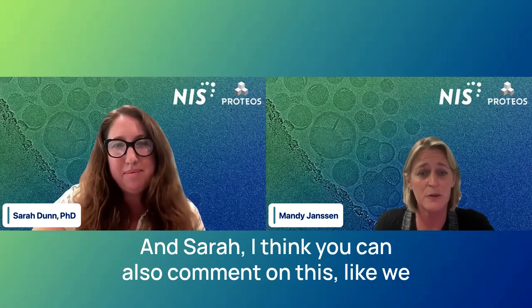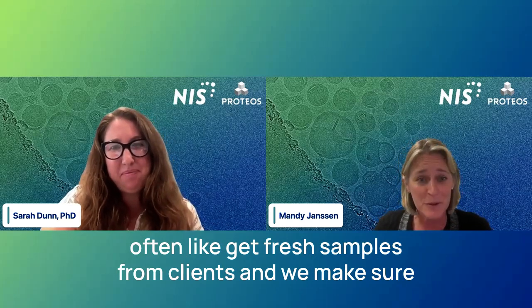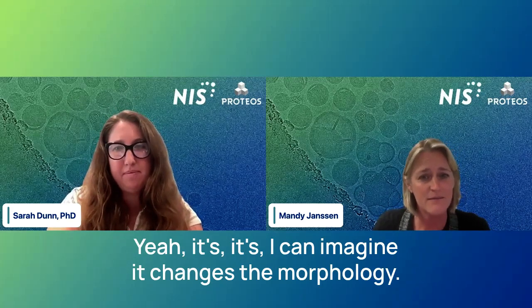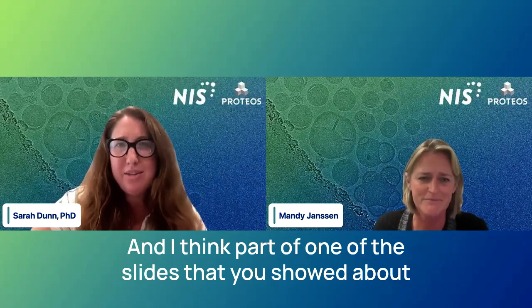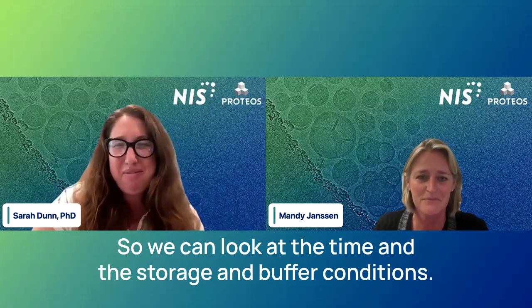And Sarah, I think you can also comment on this. We often get fresh samples from clients and we make sure we image them the same day. Yeah, I can imagine it changes the morphology. And I think one of the slides that you showed about the stability studies, right? We can look at the time and the storage and buffer conditions.